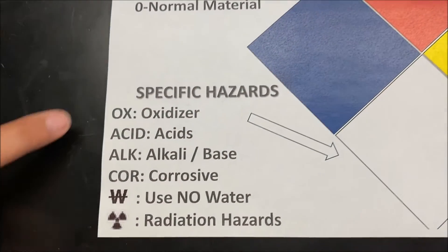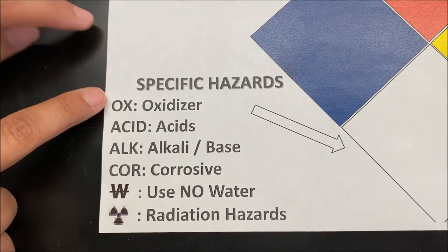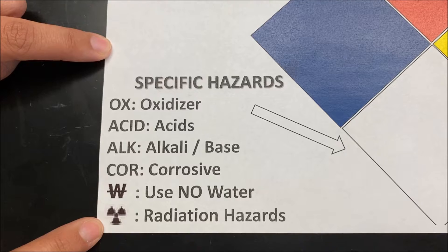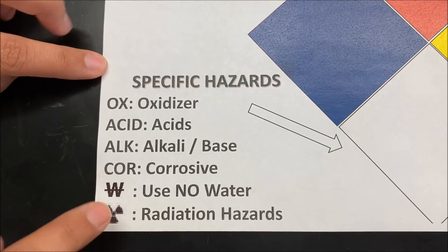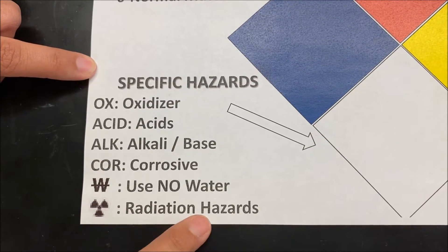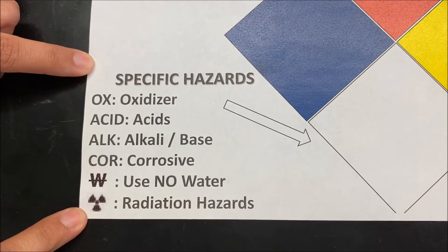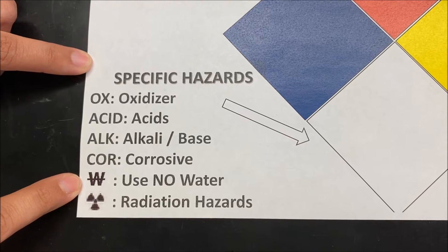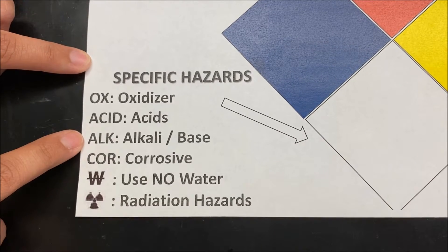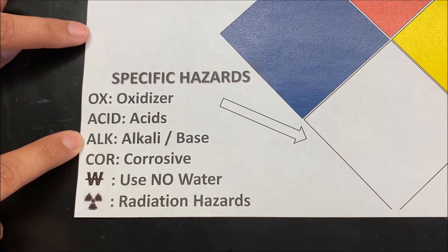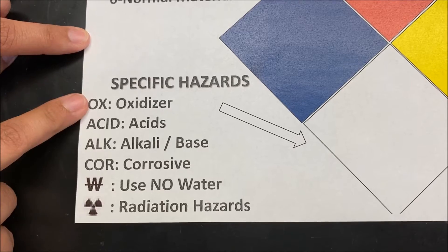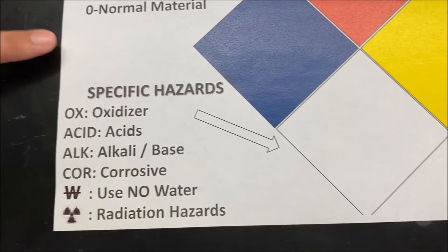The specific hazards in the white box will show one of these symbols: a radiation hazard, no use of water, corrosive, an alkali base, acids, or an oxidizer.